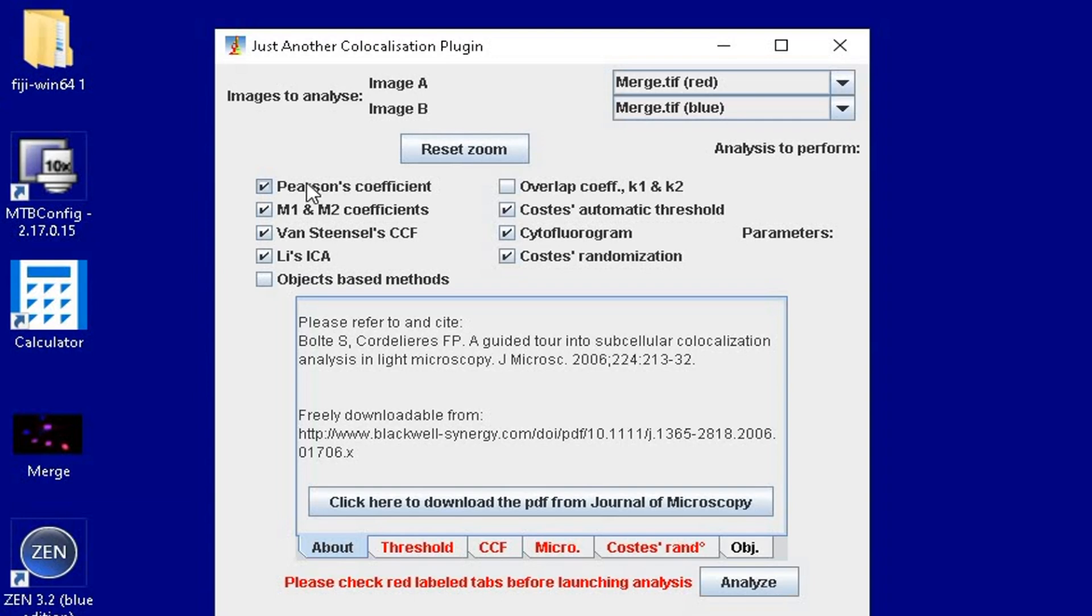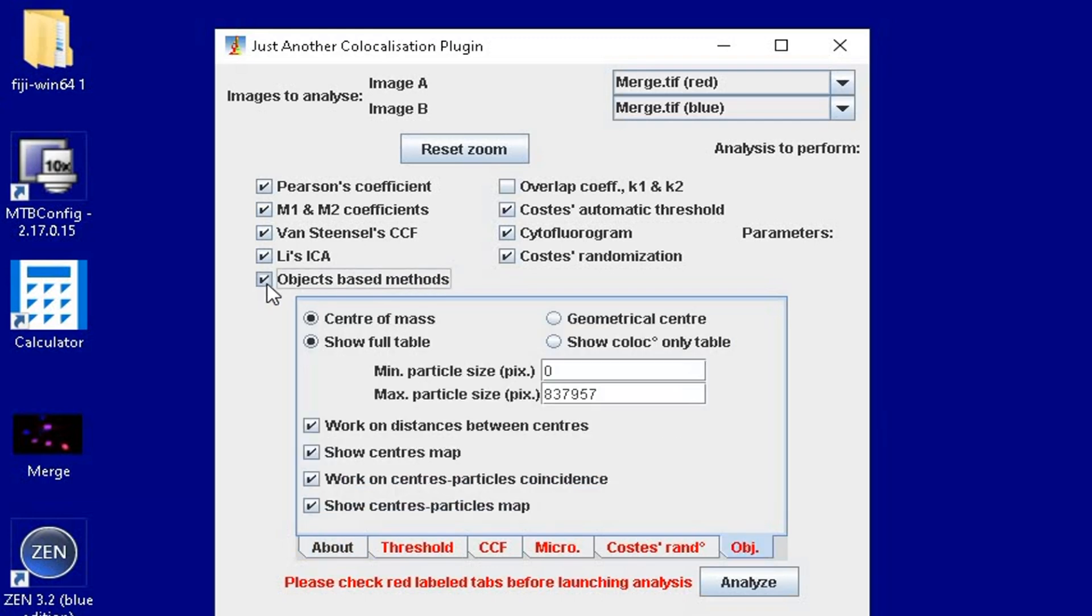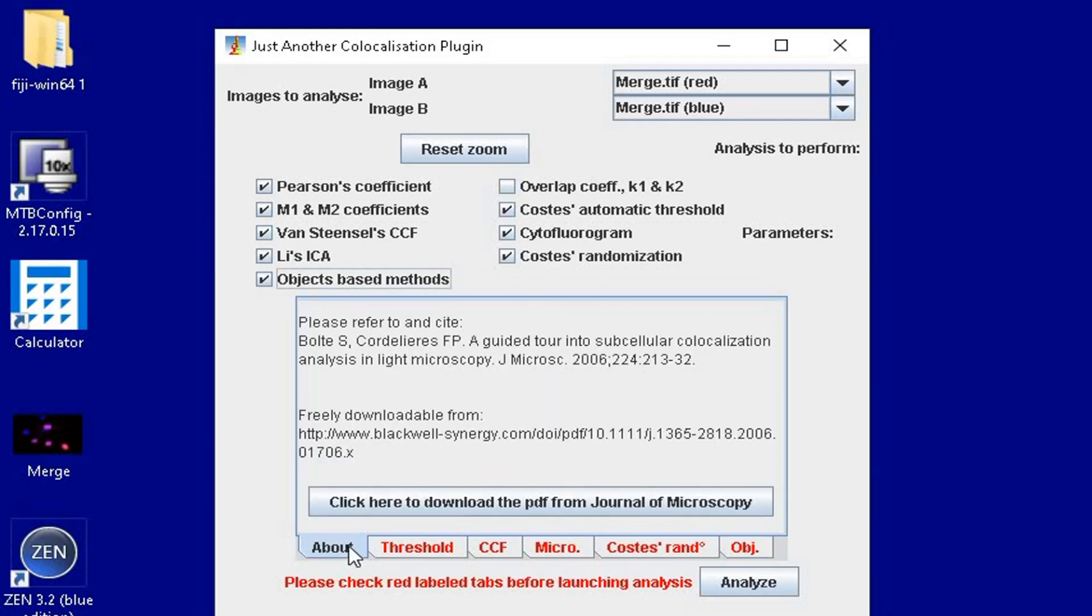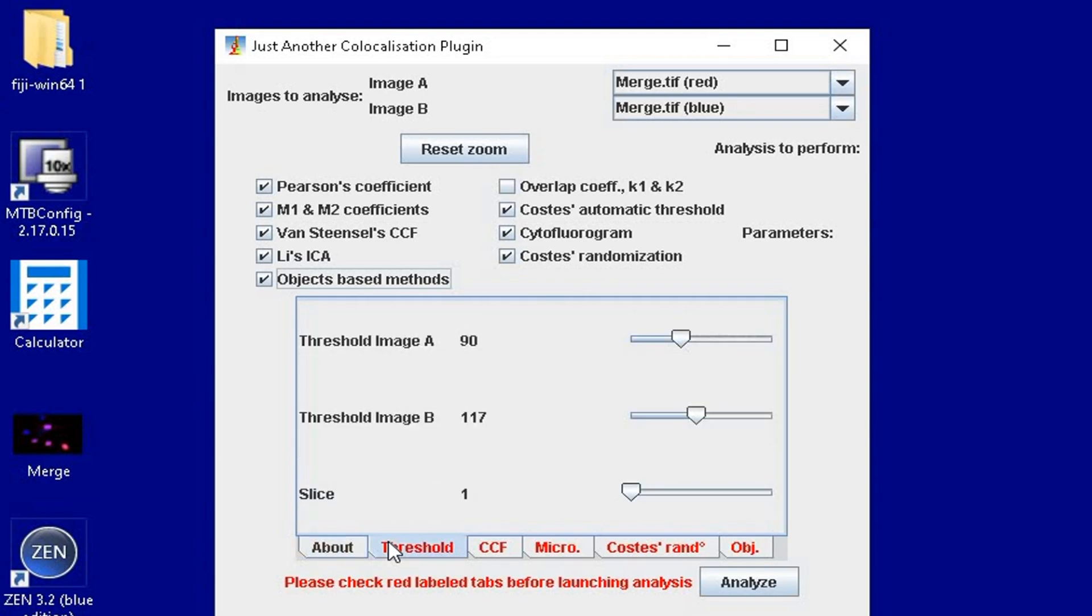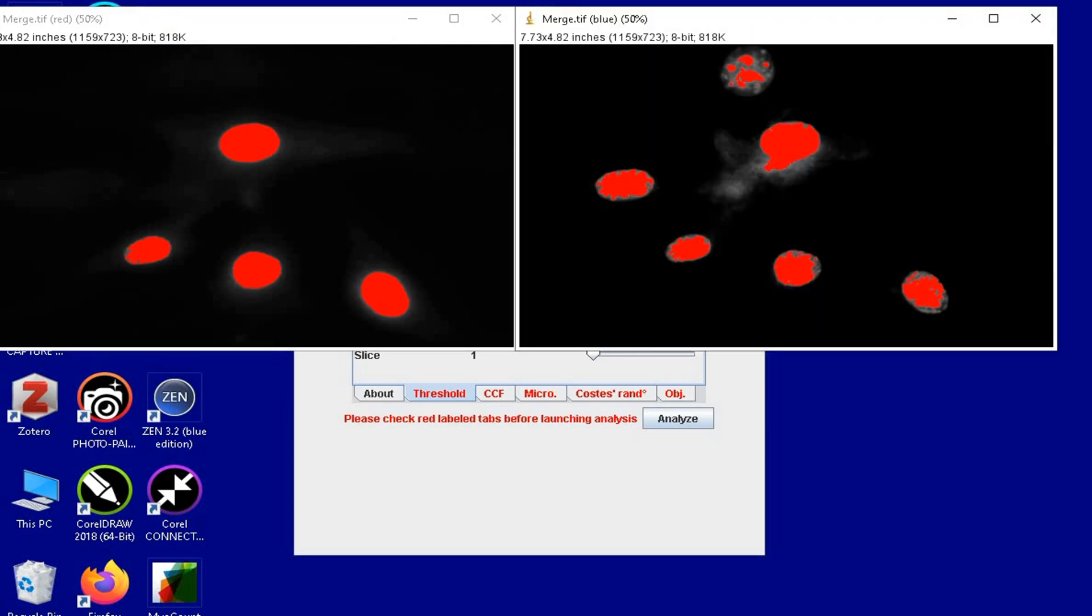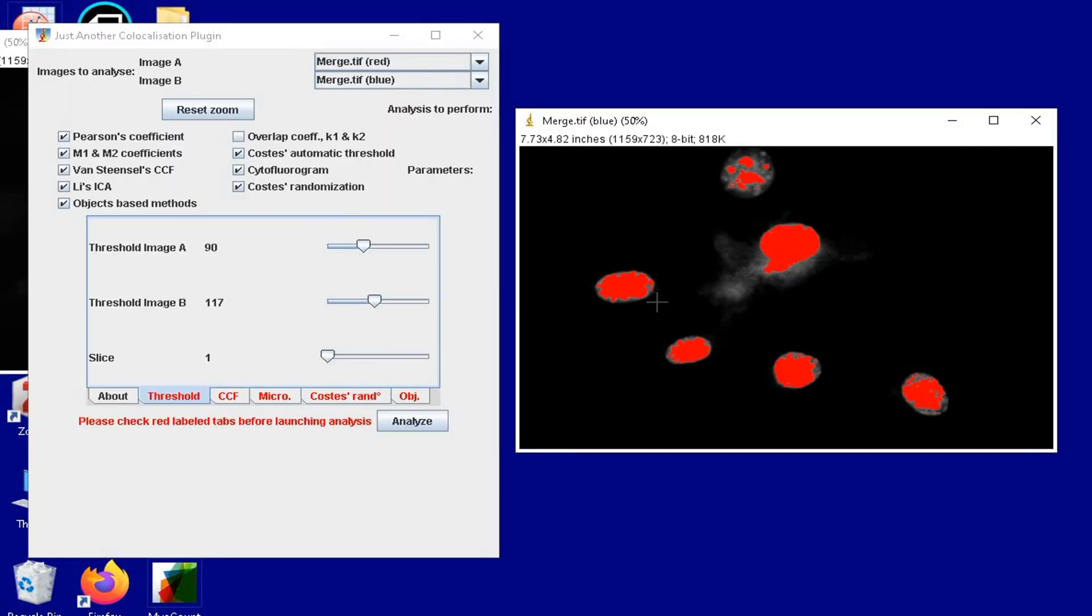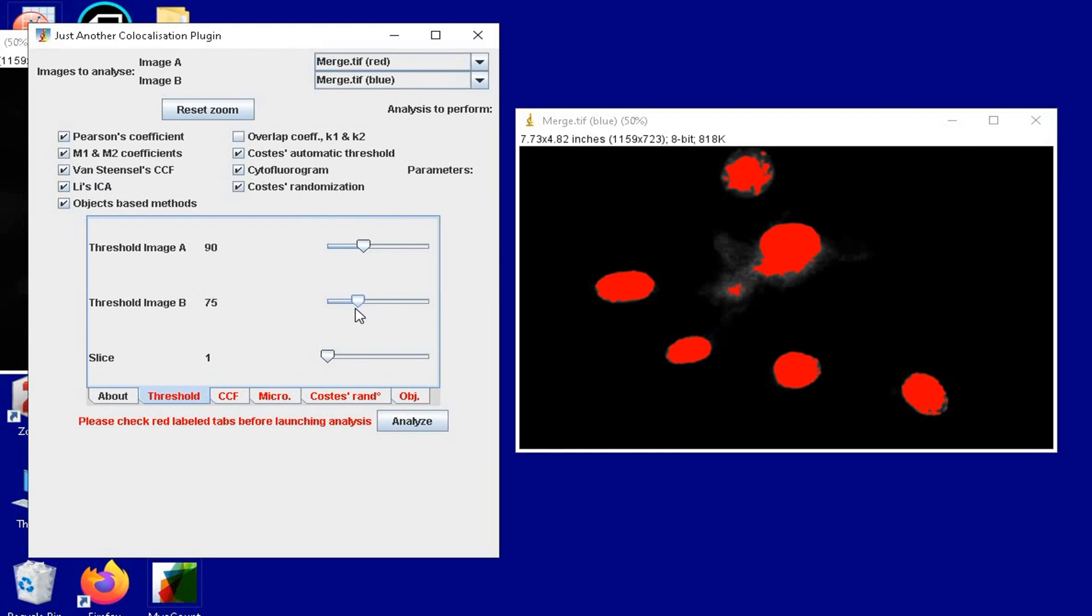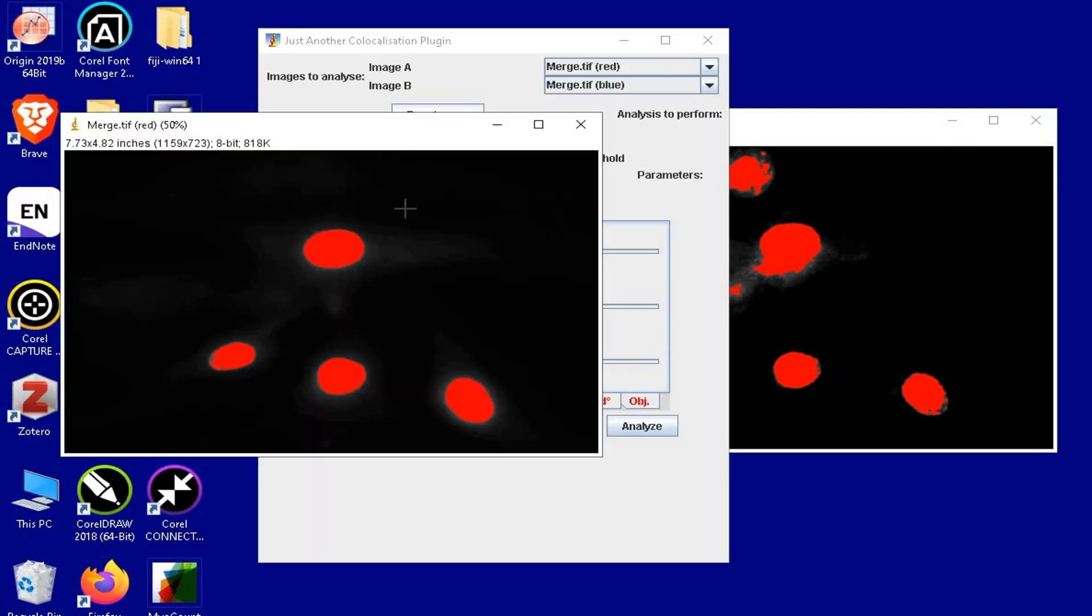If you only want the intensity based colocalization analysis, you can also tick off the object based colocalization method. Under threshold, use the slider to threshold Image A and Image B until the red mask covers the signal for each channel. For instance, in the blue channel for DAPI, the red mask can be adjusted using the slider until the staining is masked entirely. The red mask in the red channel for Ki67 seems alright and no change is required.